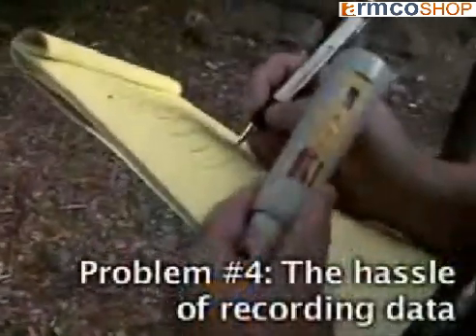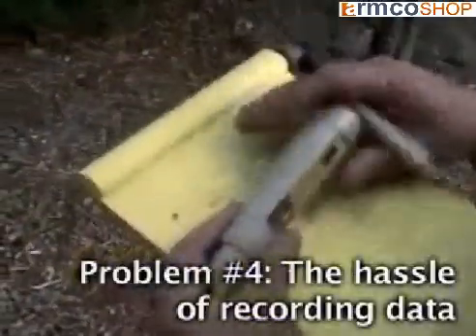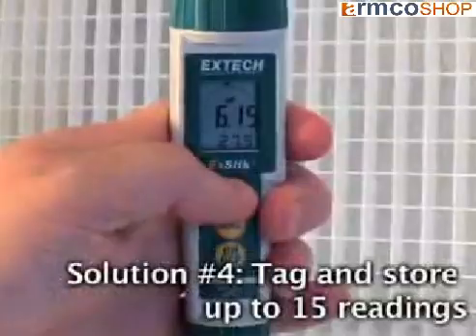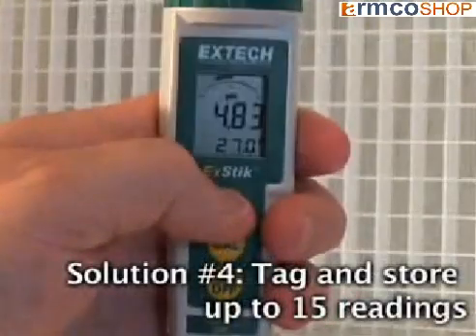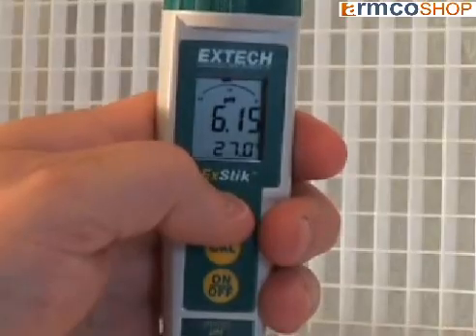Problem number four: recording data on paper can sometimes be difficult when you are taking measurements out in the field, especially during times of unpredictable weather conditions. Solution: the built-in memory featured on the X-DIC pH meter will record up to 15 measurements. Each stored reading will be labeled by a number for easy recall.